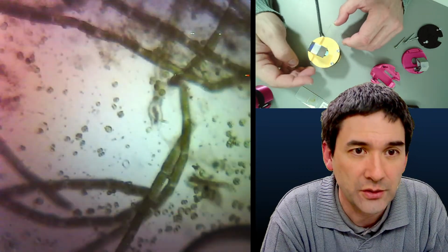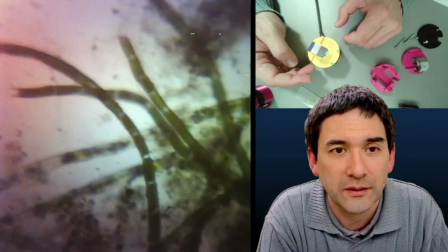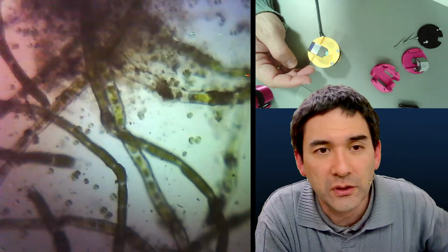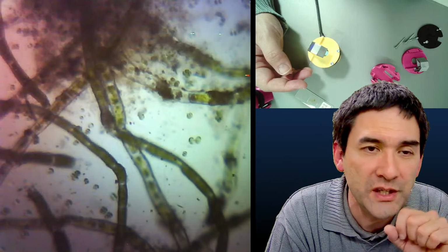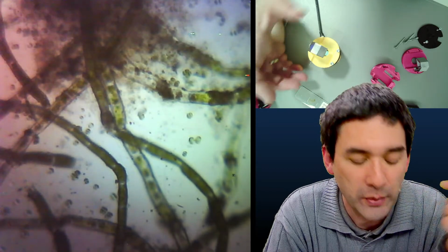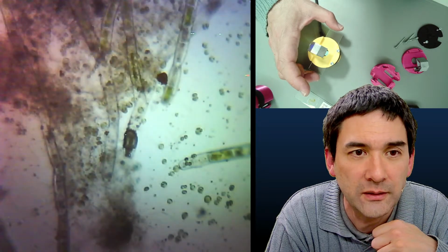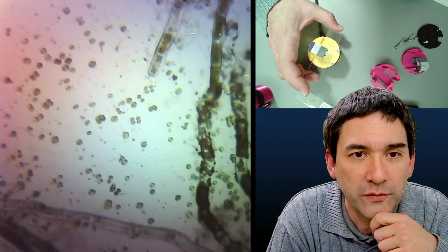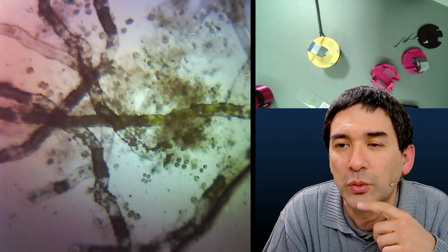Let me have a look at this sample over here that I have in the microscope, and that's also a fresh sample of some algae. I also have to tell you that the resolution is quite low. The reason why I've deliberately chosen a low resolution and not the maximum resolution is because this way the frame rate is a little bit faster, and for live streaming it's also more convenient. A whole bunch of single-celled algae here as well. So this is kind of how this works.